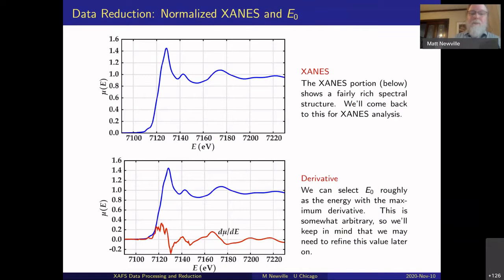That can also go to what the energy calibration is for the measurement, which can vary from beamline to beamline, at least a little bit. For iron, it's not unusual for energies to vary by 2 to 10 eV between beamlines, but a variation of 20 or 50 eV is quite a bit and unusual.